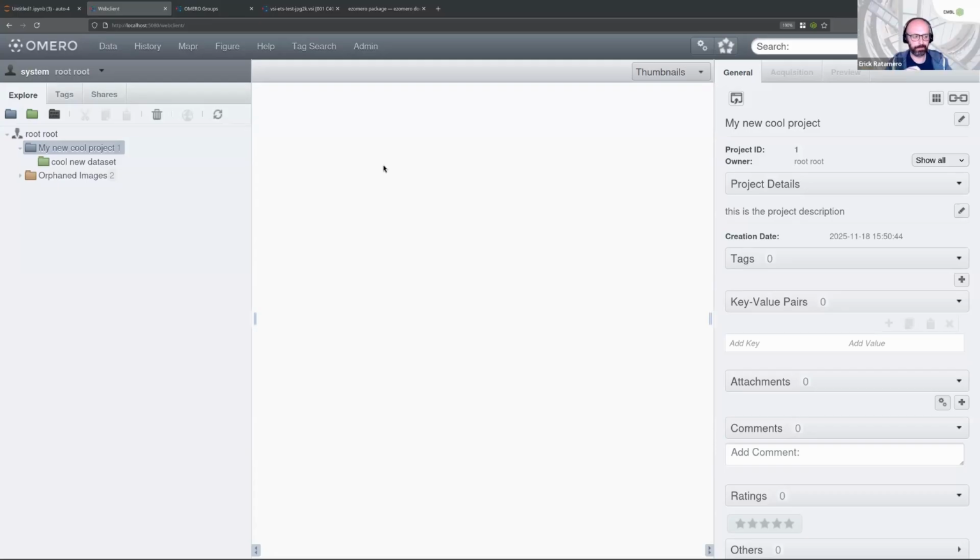I don't think so. That's where you go into the wilderness of OMERO and you create a project data set link. Yeah, cool. It gets ugly very fast, but I don't think we have anything for that. Pull requests are always welcome. If you want to write something like that, feel free to submit it.